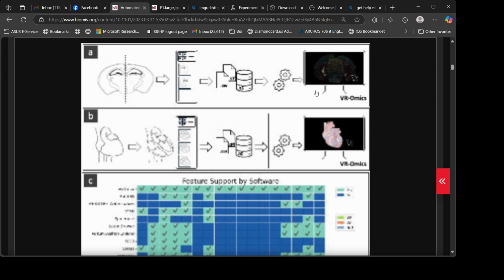This is achieved by standardizing the analysis process across various open-source programming languages, promoting consistency, and reducing variability that arises when using multiple packages and coding languages. To demonstrate the comprehensive capabilities of VR-Omics, we conducted an extensive evaluation on common analysis workflows encompassing data input/export handling, visualization, and general utility, among a broad spectrum of ST tools outlined in Figure 1c, 6, 7, 10, 13, 17 to 21. We systematically identified the essential steps required for analyzing both coplanar multi-slice tissues and depth-stacked datasets.